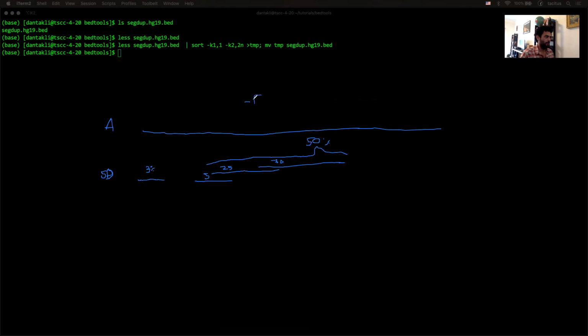But they're broken up, and so if we use the restriction I'm going to show you, the f 0.5 option, it's not going to work. So to overcome that, what we're going to do is merge, and essentially when you do the merge operation, it's now going to merge these into one unit.